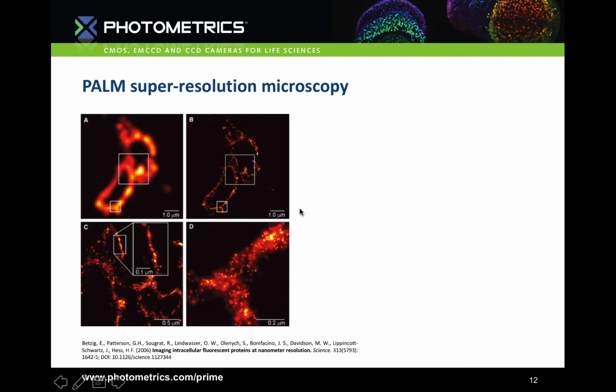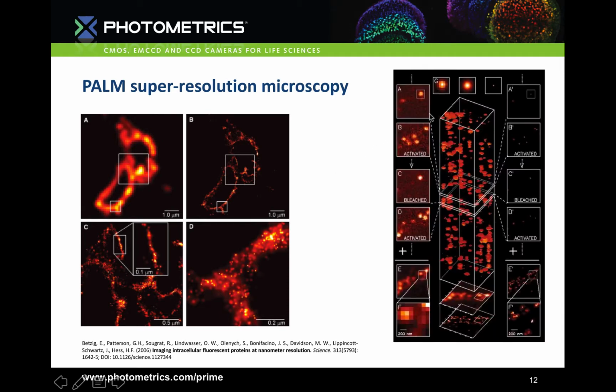Well, the key feature of photoactivatable fluorescent proteins is that they exhibit no fluorescence until stimulated by certain wavelengths of light. So initially all photoactivatable fluorescent proteins in the specimen are inactive. I'll use this 3D stack in the middle here to explain the method. Importantly, it goes down on a time axis, so the first frame is at the top where there is no fluorescence.